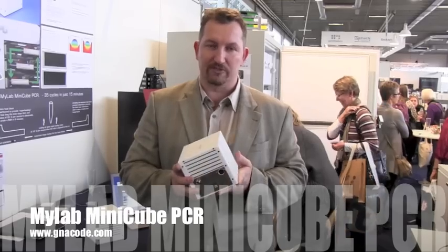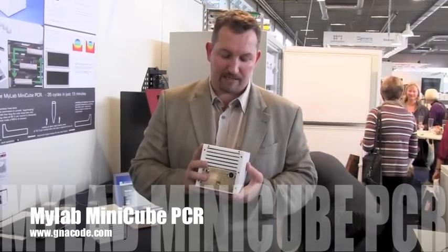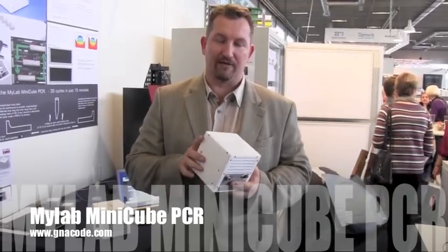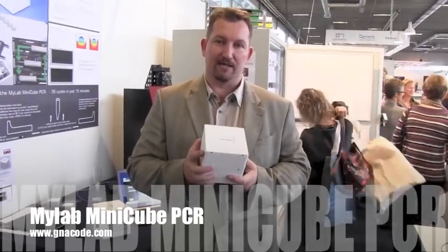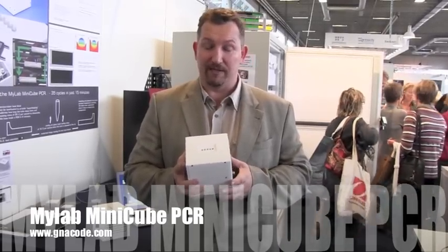We also optimize the superscript, so if you need to do an RT step, we can provide a protocol on our website to get your superscript down to 2 minutes. Overall, you will have 17 minutes for an RT-PCR, and 15 minutes for a bacterial or DNA assay.